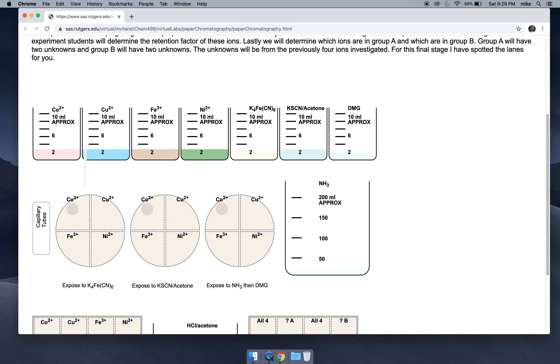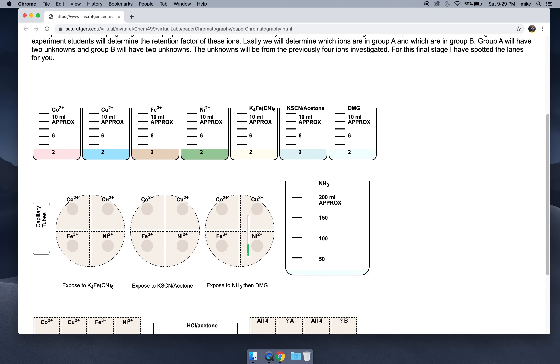Get a new capillary tube and get copper. Spot here, here, and here. Get a new capillary tube, iron. Spot, spot, spot. New capillary tube, nickel. Spot, spot, and spot. We have all four ions spotted.